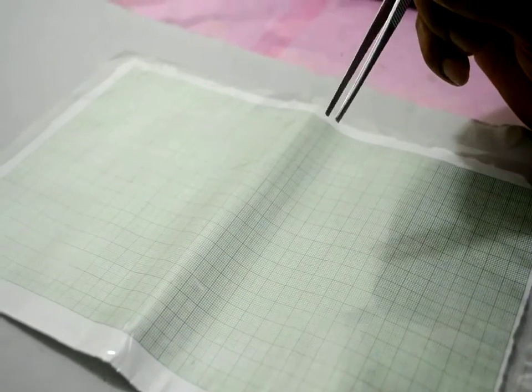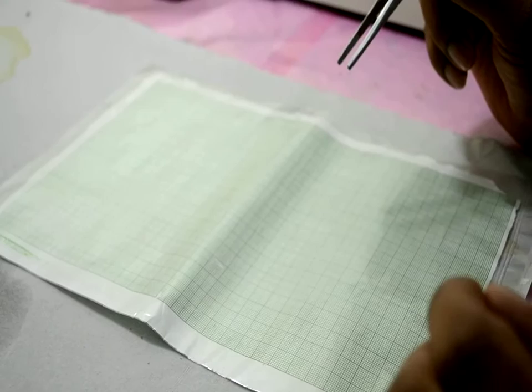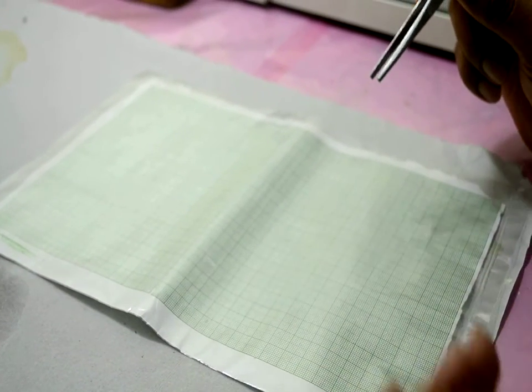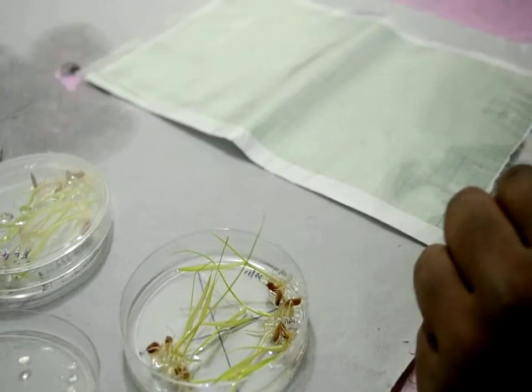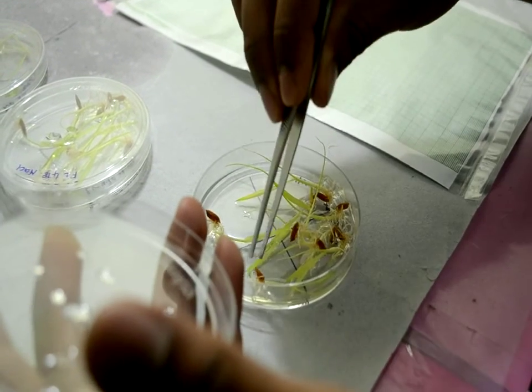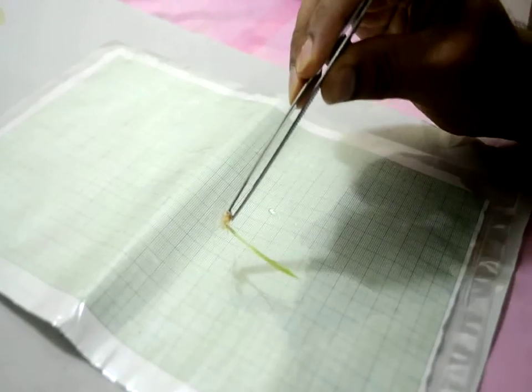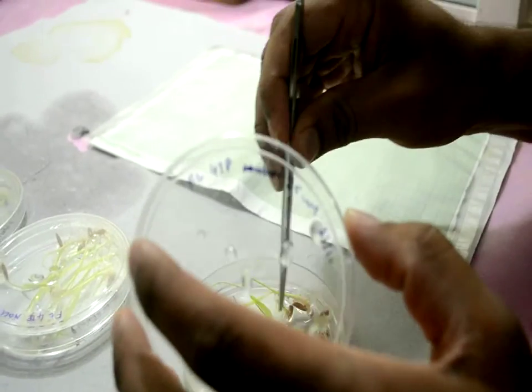One objective of this project is to measure the shoot elongation rate by taking a series of measurements every day for a week, in order to monitor and analyze the growth pattern of tolerant and susceptible rice genotypes. To measure the seedlings, the lid is opened, each seedling is carefully removed using sterile forceps, placed on a graph sheet to measure shoot length, recorded in the data sheet, and then placed back to continue growing.